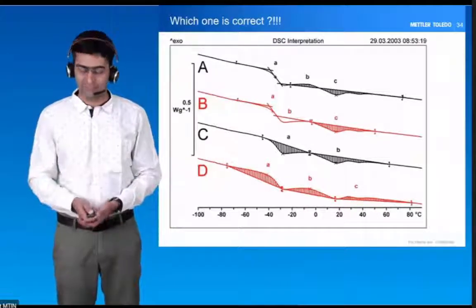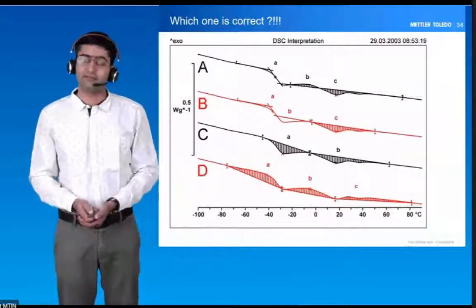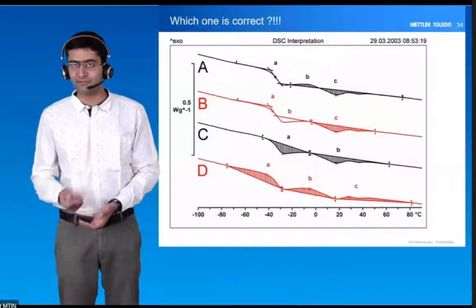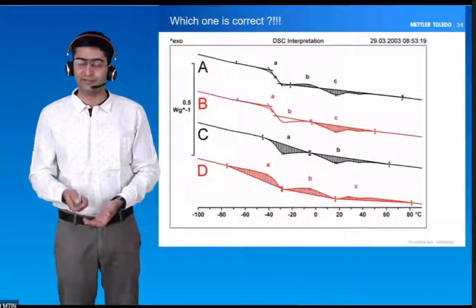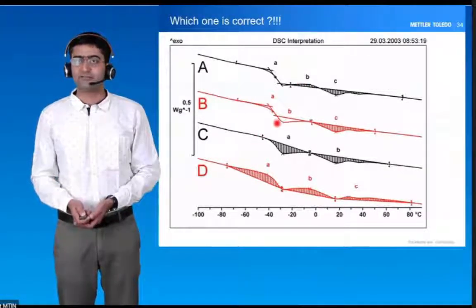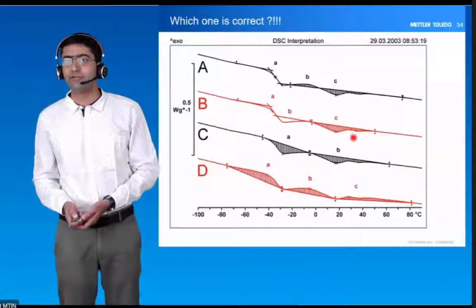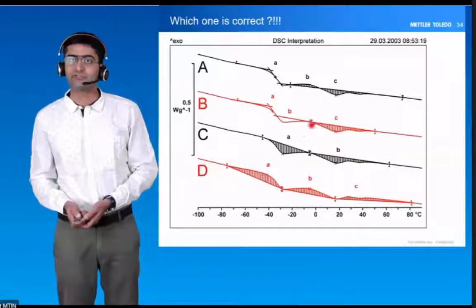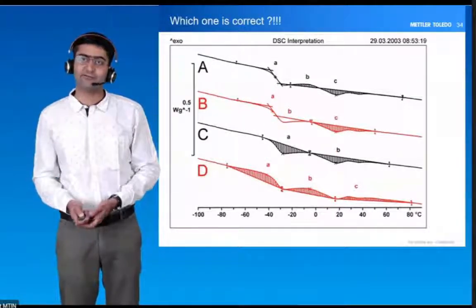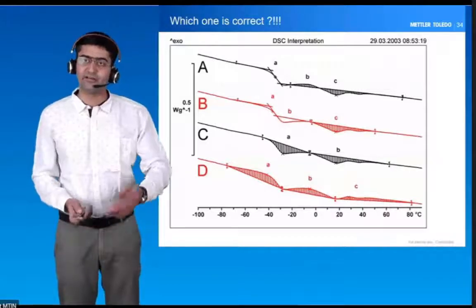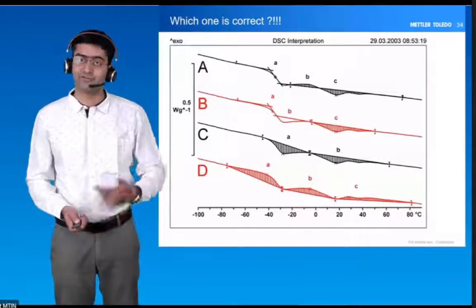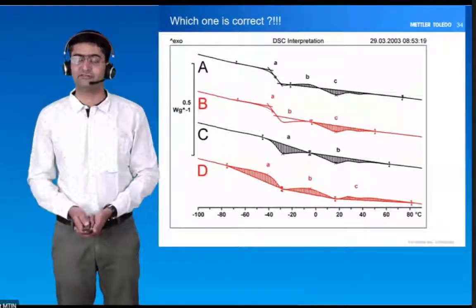This was actually a glass transition. The sample is EPDM polymer, and what you see is actually a glass transition temperature followed by the melting of some of the crystalline phase. But the same event was interpreted differently by different users because of different baseline selection.